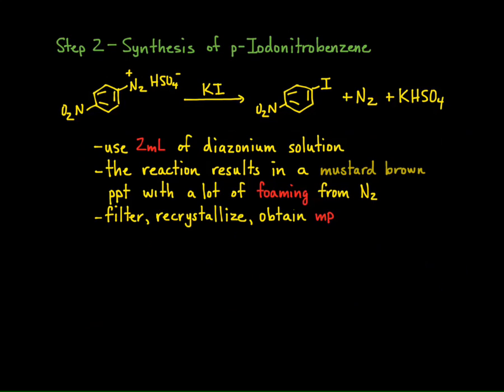The reaction results in the precipitation of a brown solid, and a lot of foaming occurs due to the liberation of nitrogen gas. Simply filter, recrystallize the product, and obtain a melting point.